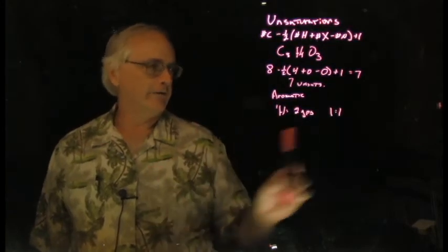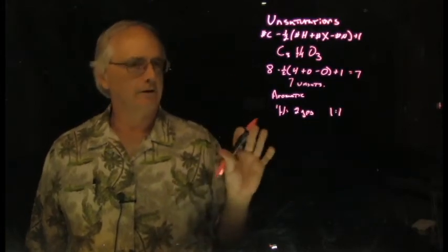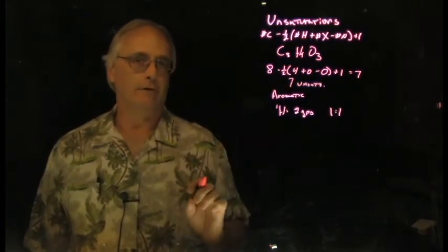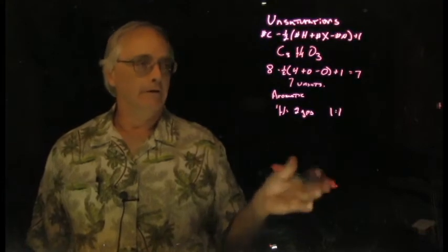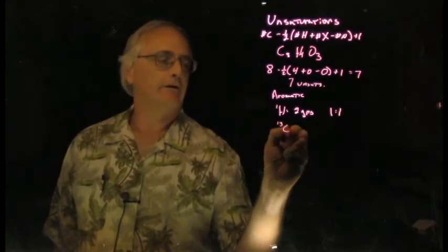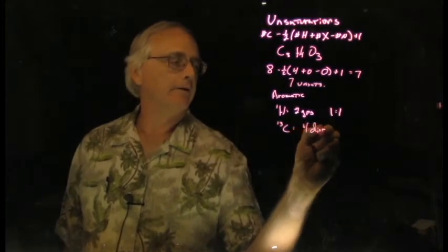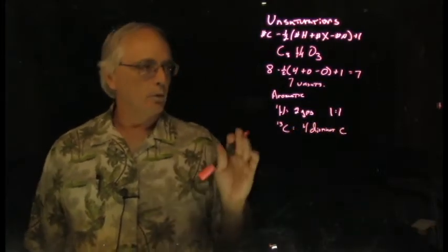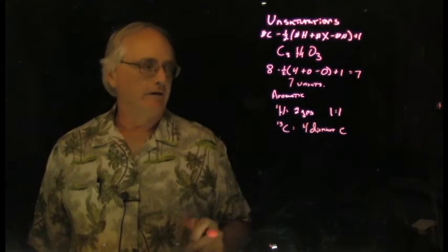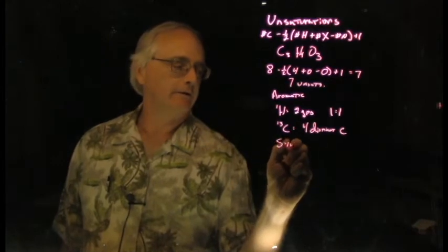There are a total of 4 hydrogens here. This only adds up to 2. In the back of your head, a little bit of warning, there might be some symmetry in this thing, because the integrations are not adding up to the total number of hydrogens, adding up to half that number. So symmetry is a likely issue here. But before we get ahead of ourselves, we look at the carbon spectrum. And what we see are 4 distinct carbons. Once again, the formula tells us there are 8. What we see is 4. Once again, we are looking at a strong indication of symmetry. This molecule is symmetric.